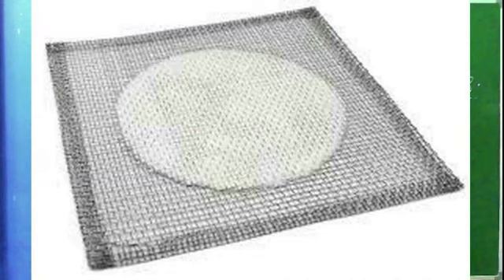We can see a thin asbestos sheet that is fixed at the center. It is used to keep the glass apparatus on it while heating is in progress and also for uniform distribution of heat.